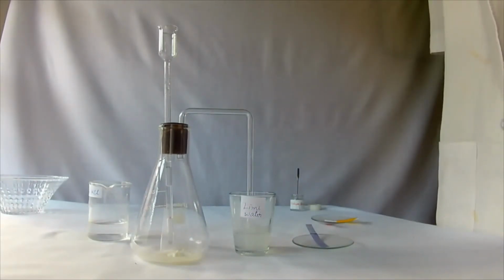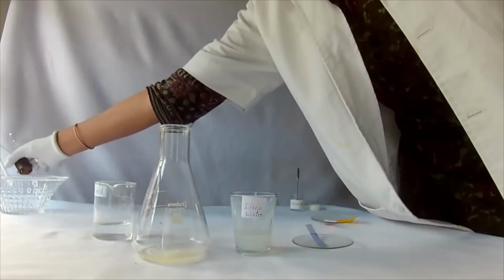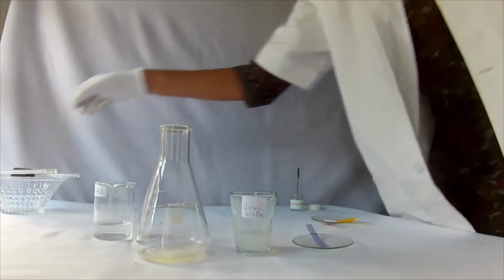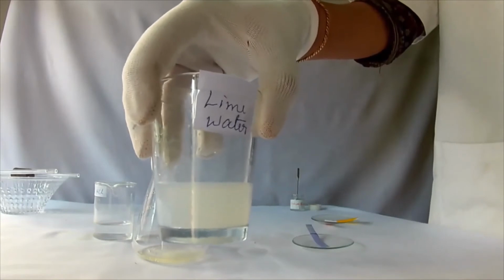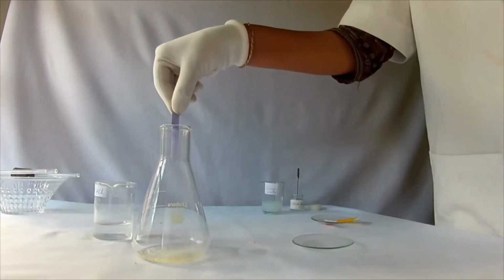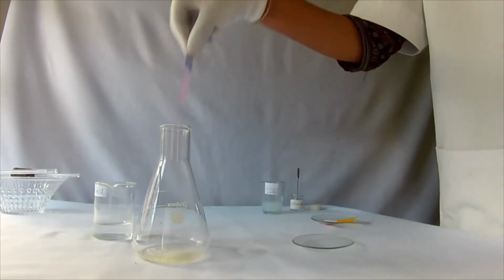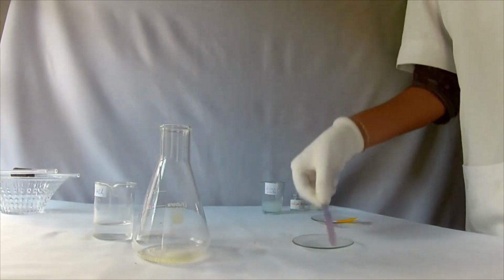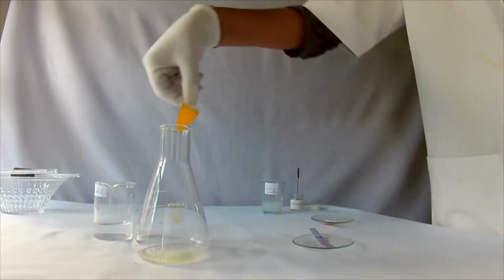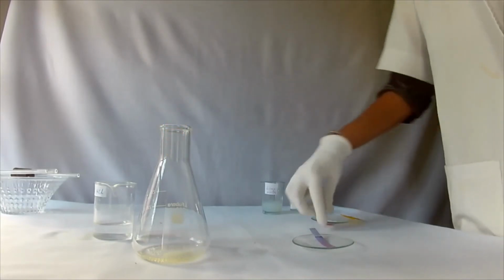Observe carefully. The lime water changes to milky white. Carbon dioxide changes lime water to milky white. Now bring the litmus paper in contact with the gas evolved. Its color changes to red, indicating that carbon dioxide is acidic in nature. Carbon dioxide gas has no effect on potassium dichromate and potassium permanganate paper.